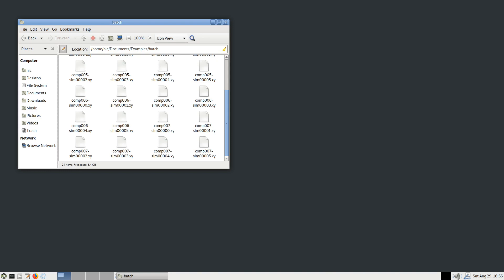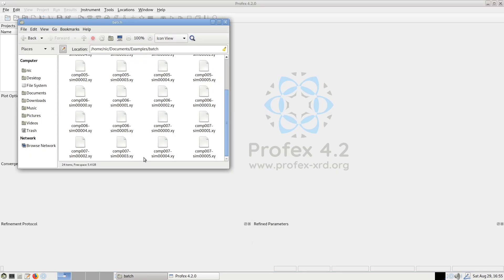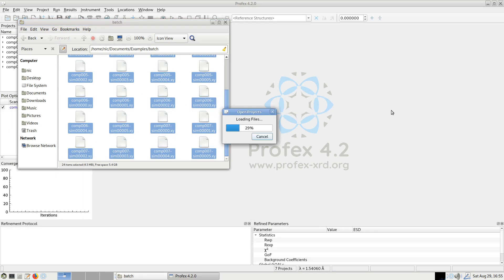I measured four materials of slightly different composition six times each to be able to determine mean values and standard deviations, so I ended up with 24 datasets in total. I can open them easily by opening Profex and selecting all the files in the file browser and dragging them to the main window of Profex.